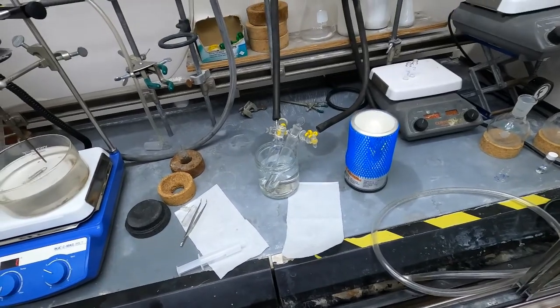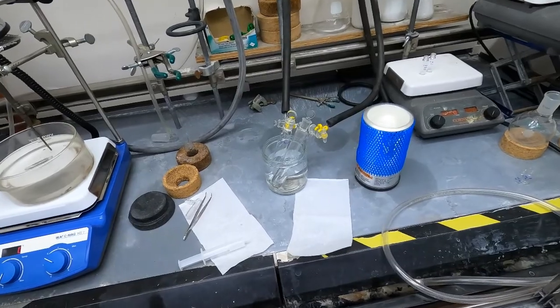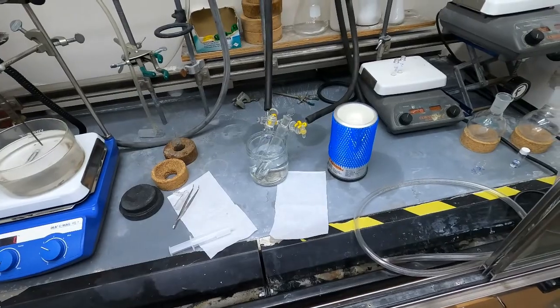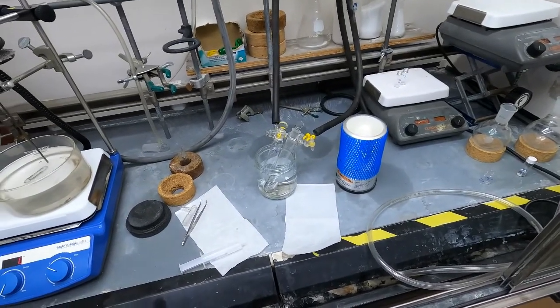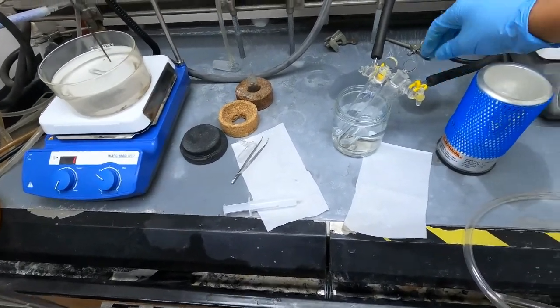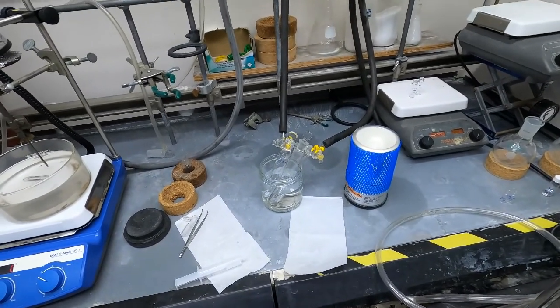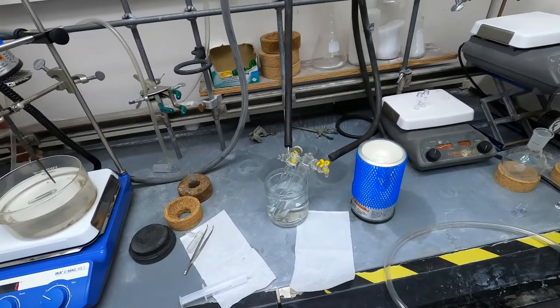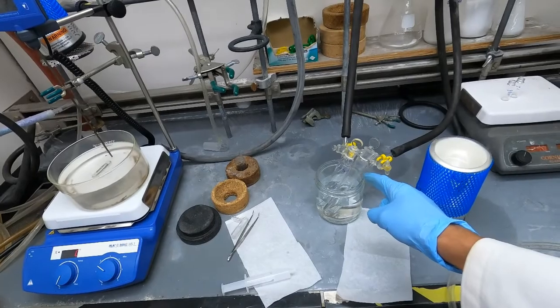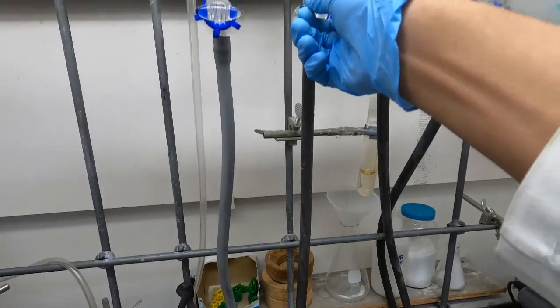A couple other things you're going to need is a high vacuum setup, a Schlenk line, and a dewar of liquid nitrogen. To get started I have both of my Schlenk tubes connected to my Schlenk line and both stopcocks are closed. The first thing we can do is open these lines up to vacuum. The contents of the tube will not be opened to vacuum because the stopcock is closed.